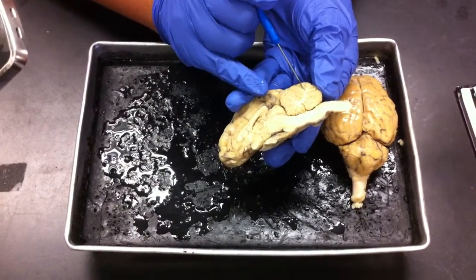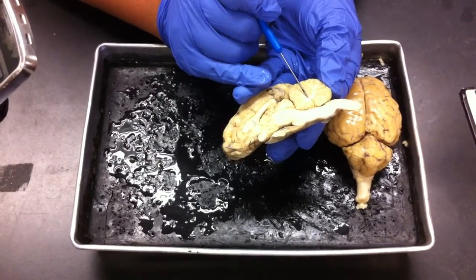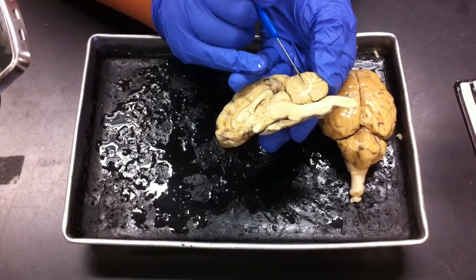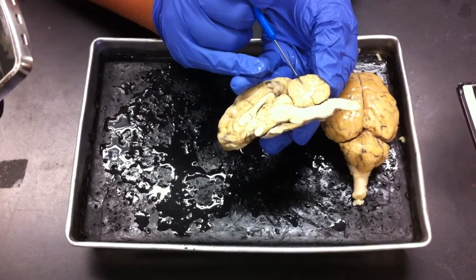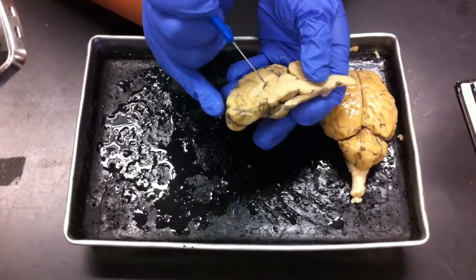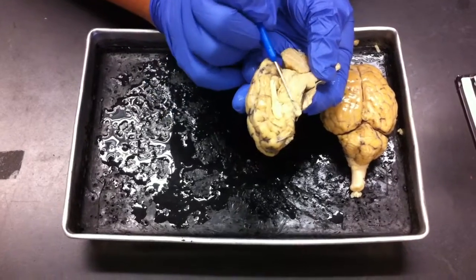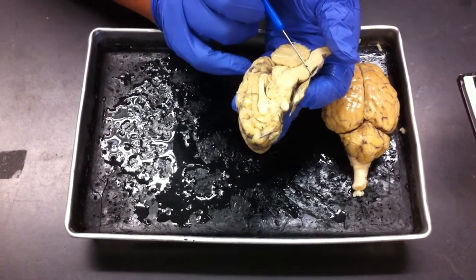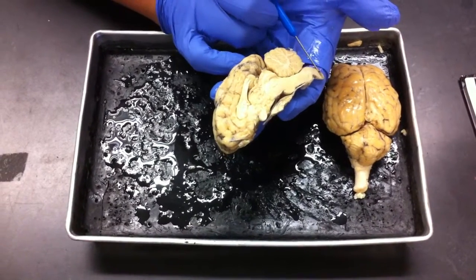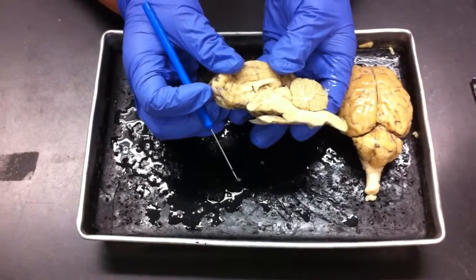This white structure right here, just like in our models and in humans, is the arbor vitae, meaning tree of life, and it is made up of white matter, meaning that what is surrounding it is the gray matter. Like I said earlier, the diencephalon would be a little bit higher up. This area right here is the midbrain, this is the pons, and this area down here is the medulla oblongata. From this point on is the brainstem. Any questions so far?